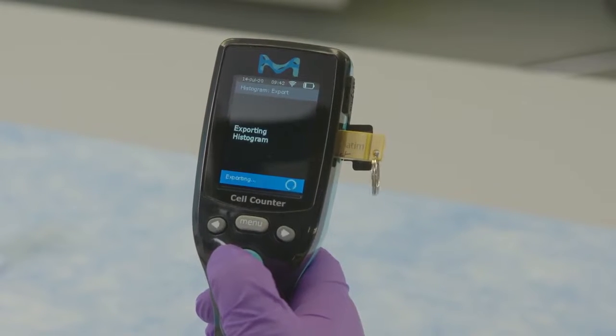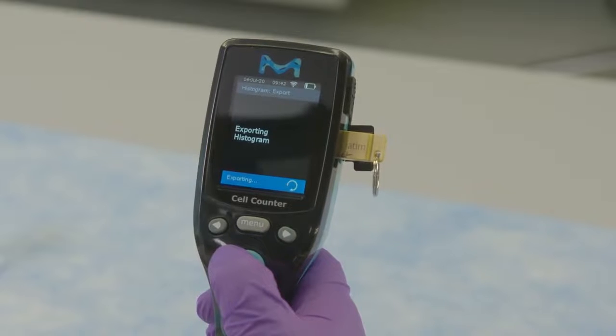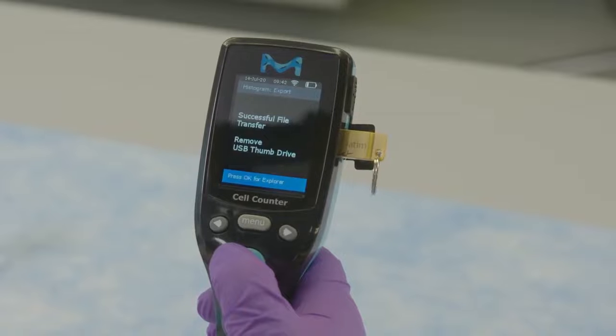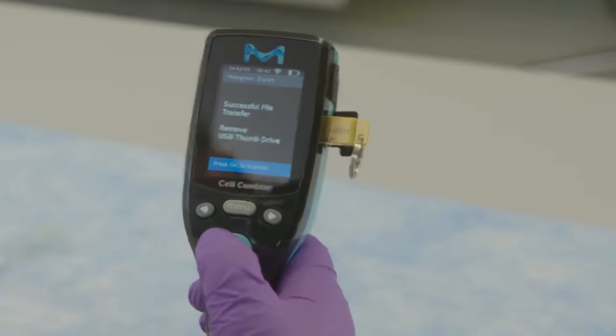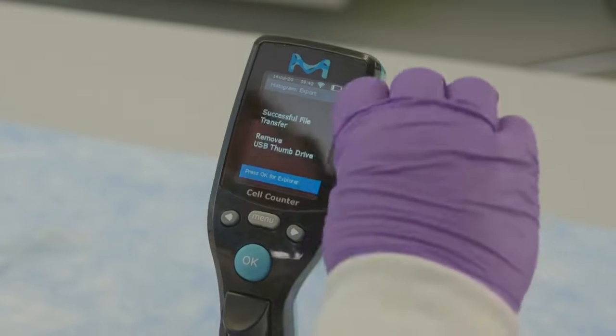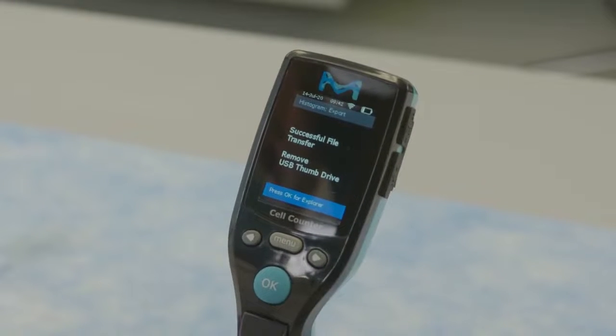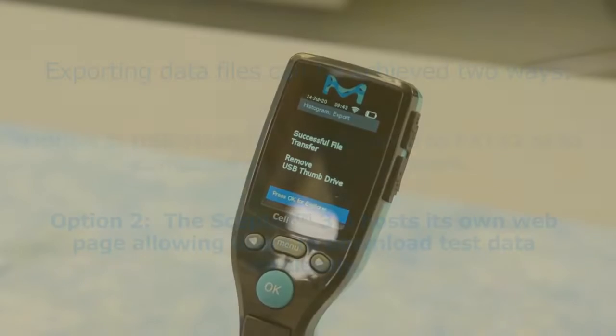Histograms will be displayed on the screen and image PNG and data CSV files are exported. Export is complete when the successful file transfer remove USB flash drive message shows on the screen. Remove the USB flash drive and press OK to return to the main histogram explorer screen.